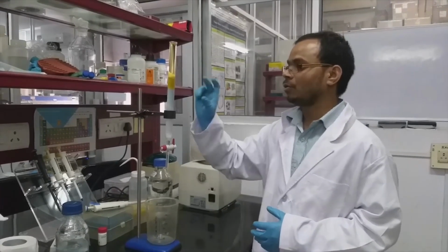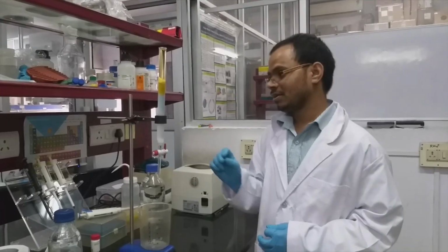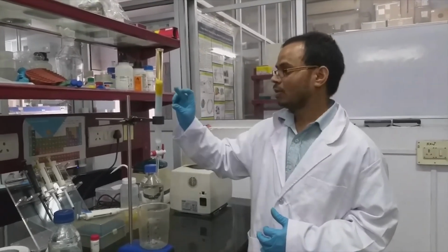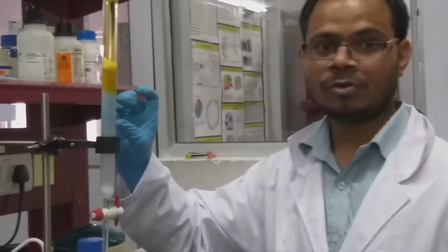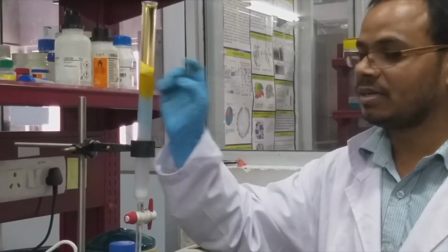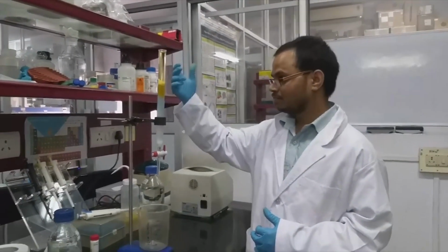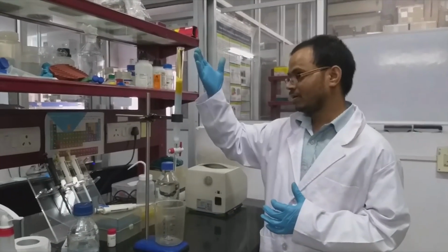As we can see, we have loaded two components. One is the high molecular weight blue dextran, another one is fluorescein, which is low molecular weight. So as we can see, this corresponds to blue dextran. So it is eluting fast compared to the fluorescein, which is yellow, orange in color. So you have to elute it completely using the buffer.